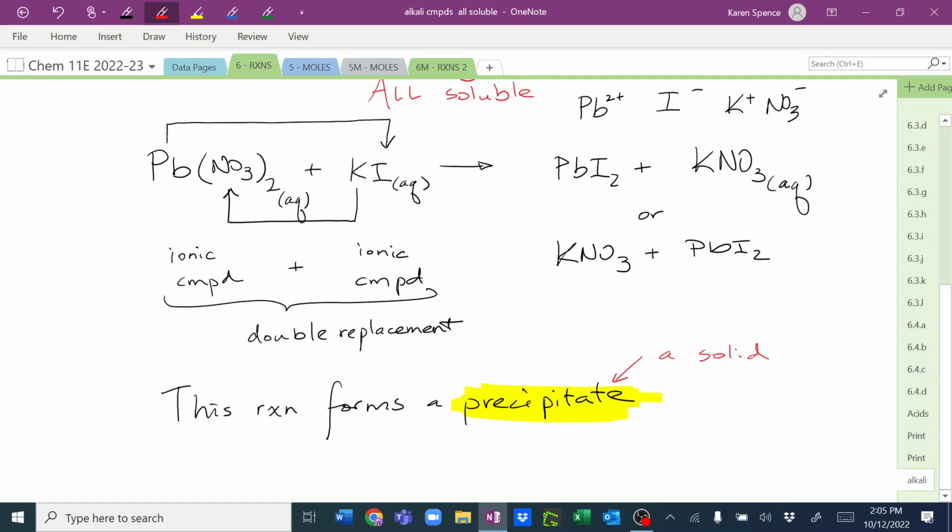Yo, it looks like that thing that I saw. Why does it look like a bubble machine? Russian roulette. You can spin it. It spins. Do you think this works better with our hands or my hands?